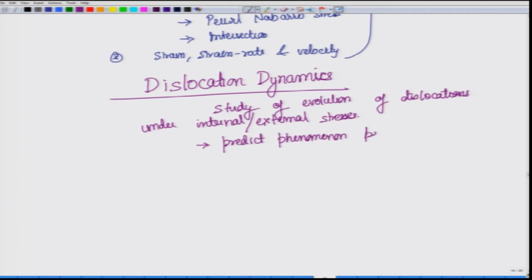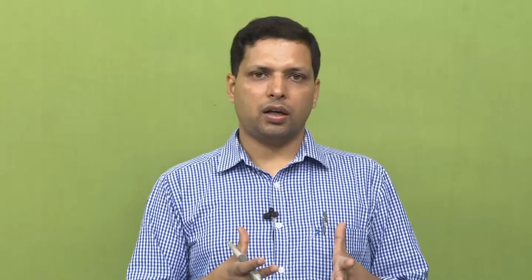We will come to it in more detail, but it is just the dislocations getting accumulated at one place when you apply stress. Everything that is happening is understandable in terms of the concepts that we have covered. So this is where dislocation dynamics comes into the picture. Whatever phenomena are observed, we should be able to explain, or even predict or simulate, using the concepts here.